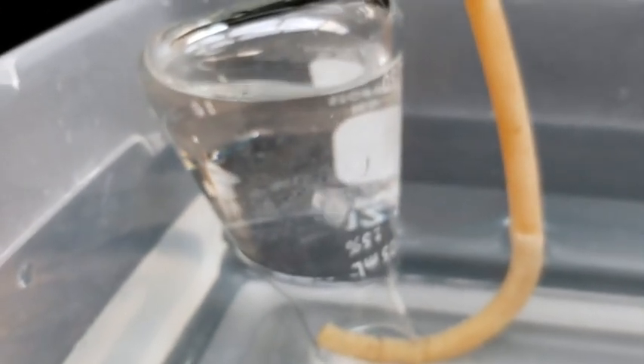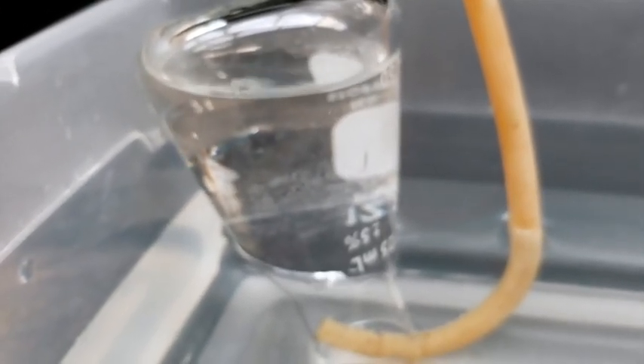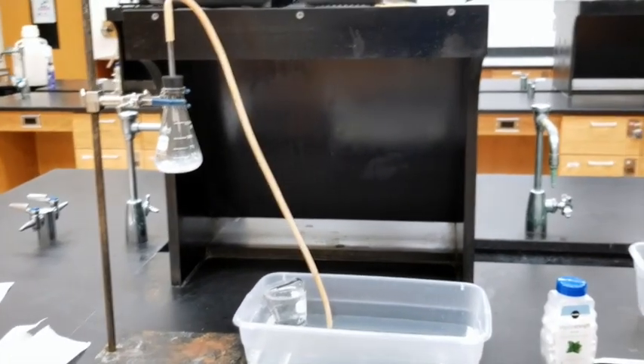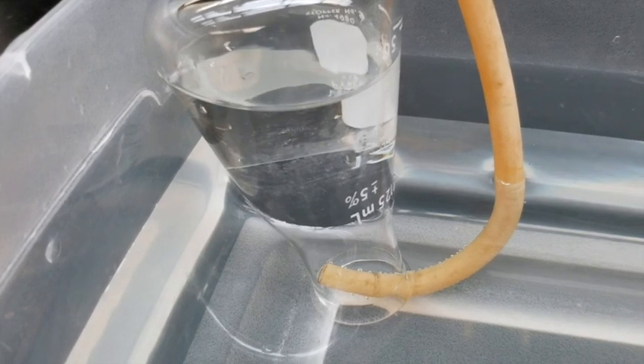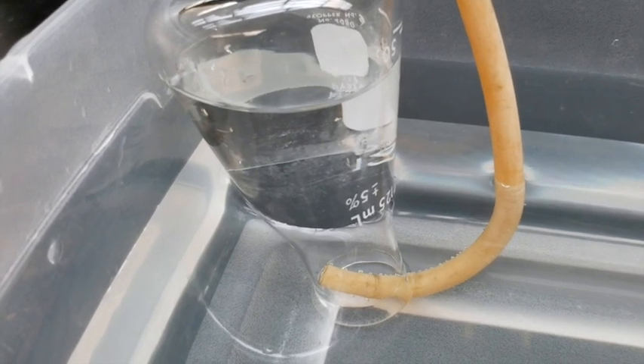Do not wait to collect the gas because you're not interested in the purity of the gas. The antacid tablet will quickly react with the hydrochloric acid and the gas will be generated. You'll be collecting the gas in the Erlenmeyer flask that you inverted into the water trap. Continue to collect the gas until all the pieces have completely reacted and dissolved.